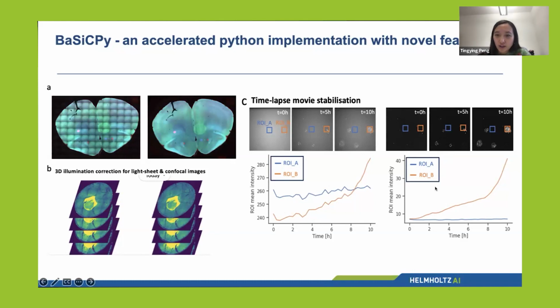After you do the correction, at the beginning of the movie, because there are only stem cells and no cells come out, it's the same, close to 0. Then after you have cells, the mean intensity of the foreground patch begins to increase. And it also gets rid of this kind of background oscillation. So the quantification is now much smoother and more stable.